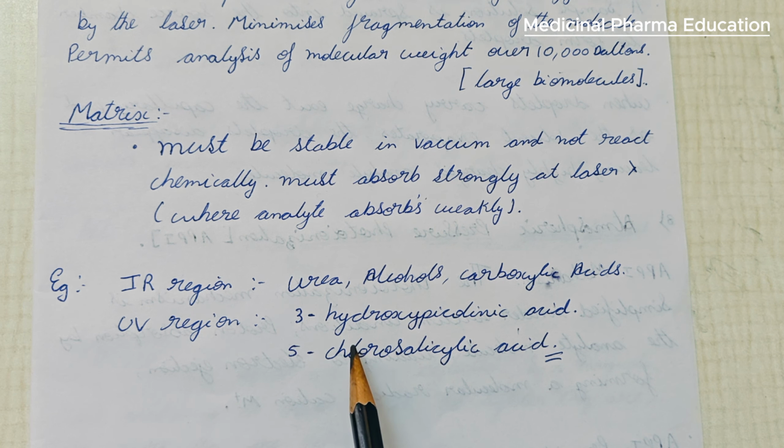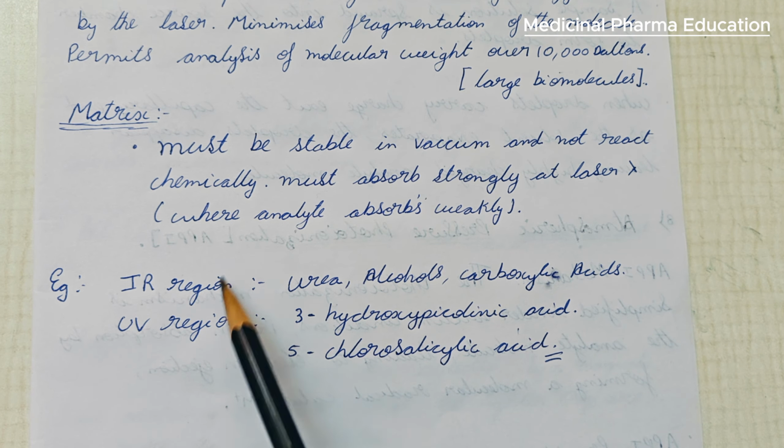For the UV region we use 3-hydroxypicolinic acid, or 5-chlorosalicylic acid.